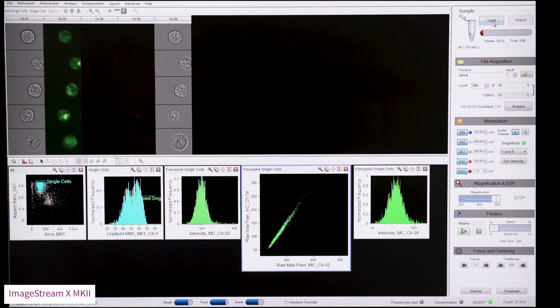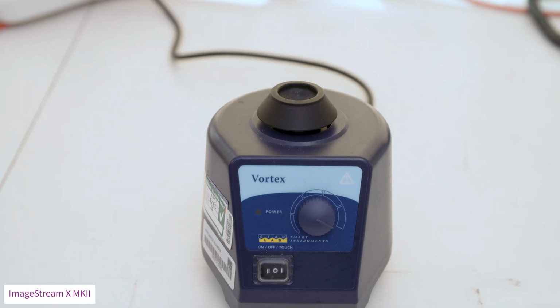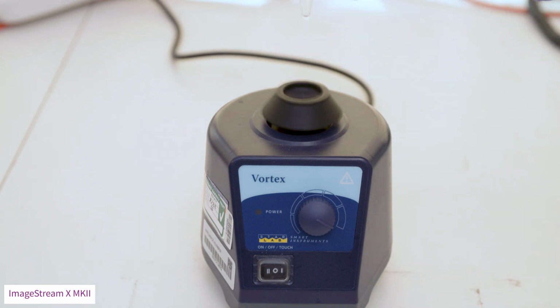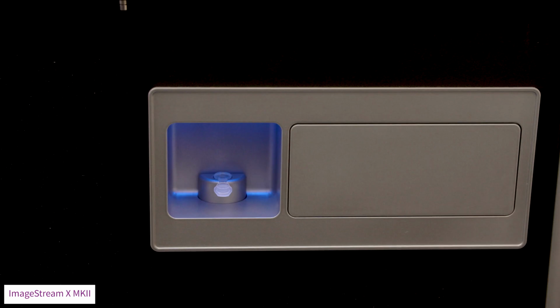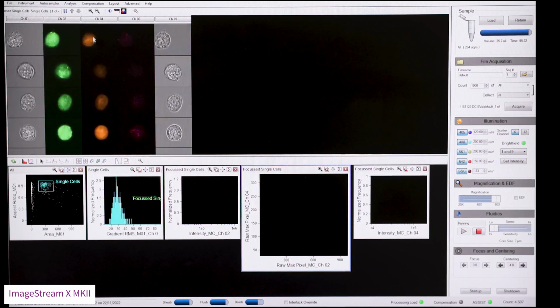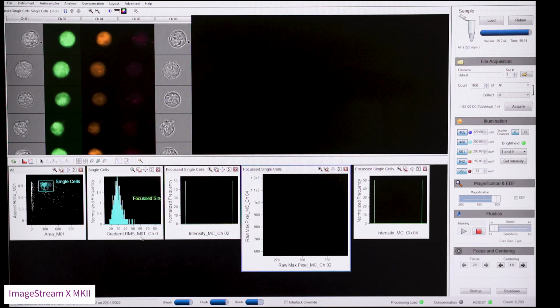I will press load again, and while the machine is flushing the sample line, I'll prepare the next tube by vortexing it. This is a sample of the same cells, but this time labelled with propidium iodide, which is an orange fluorophore, and I'm anticipating that the cells will have stained very brightly. So we can see the machine has estimated the volume and is injecting the sample. We can see immediately the cells are very bright, and they are so bright that it is actually affecting the gradient RMS of the bright field.